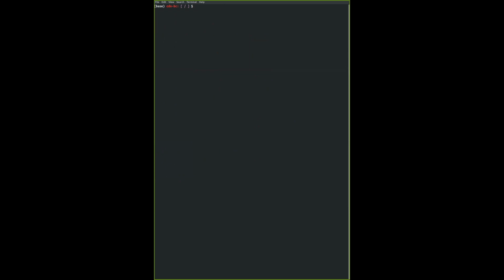There's something that I want to mention. I'm not sure if you noticed this. If you press on your up arrow key, you can actually call out previous functions that you typed. So I'm going to type 1, press up arrow once, you're going to see clear. Twice, I'm going to see all the other functions that I have used before. So it's like a history of your functions one by one. It might be convenient to reuse your previous function and then just amend the code to search for files in a different directory. It's much faster rather than typing out the whole thing over and over again.